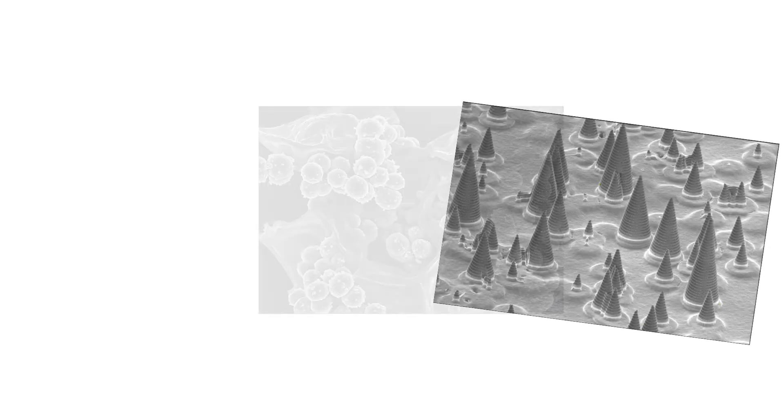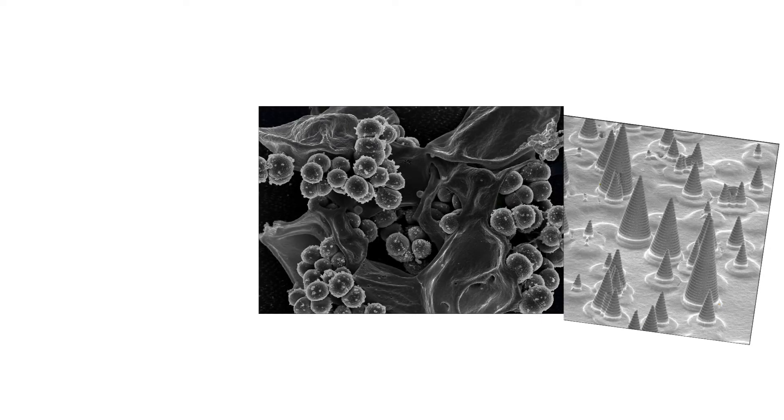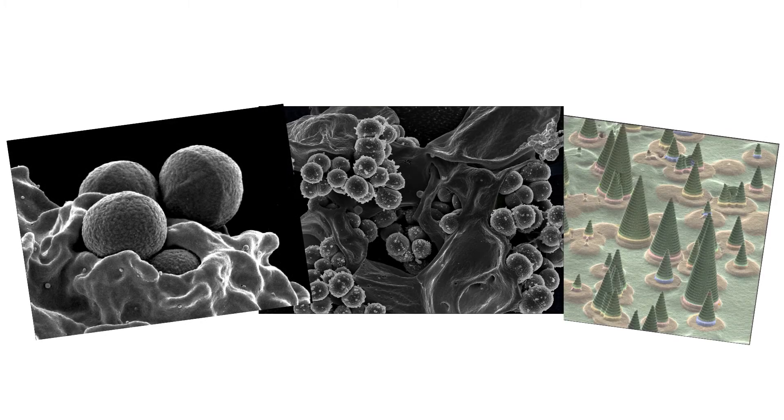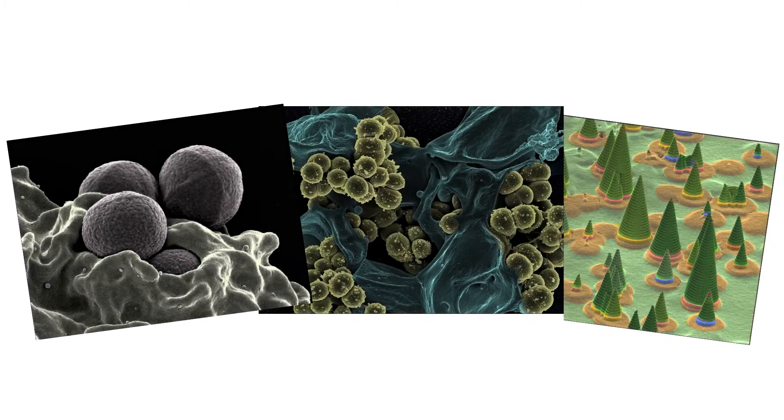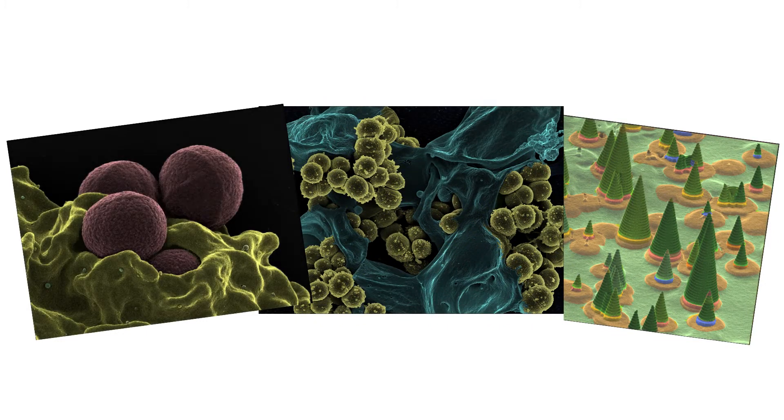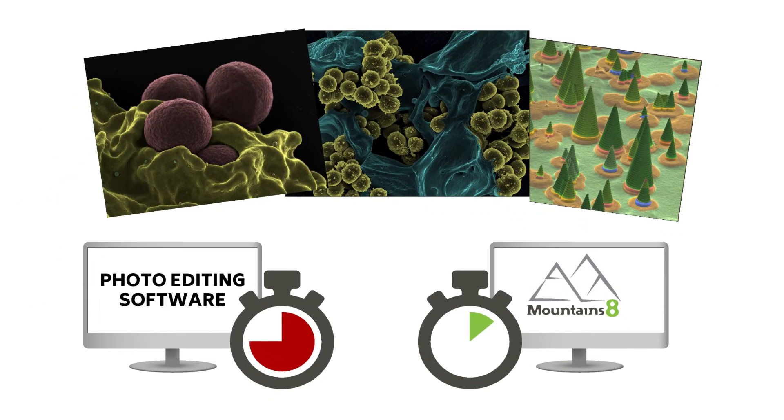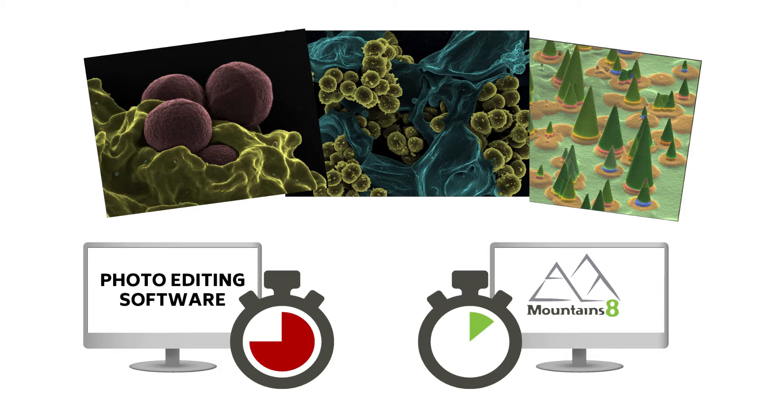Thanks to automatic object recognition, this is a really straightforward exercise and will save you hours compared to performing the same operation with photo editing software.